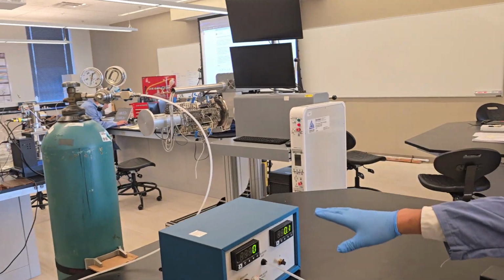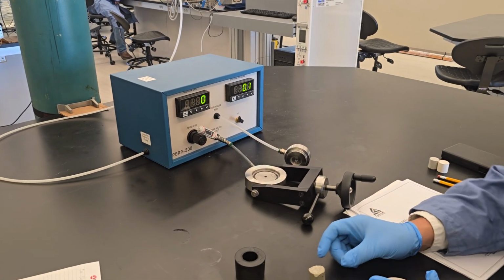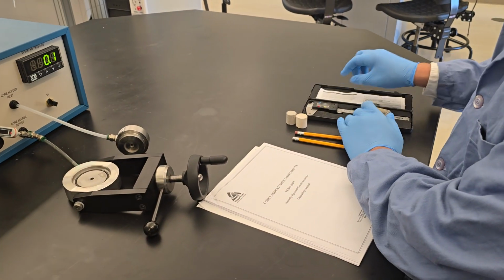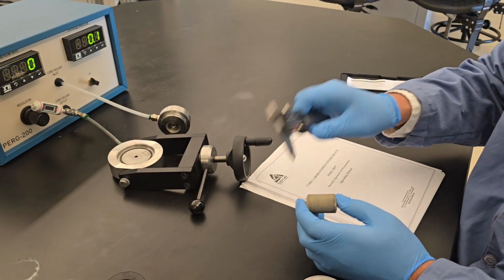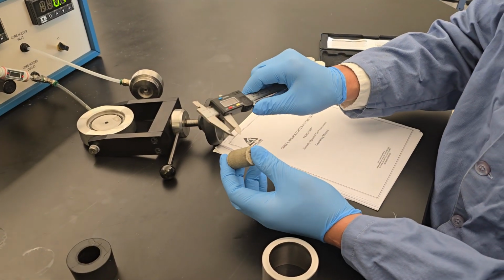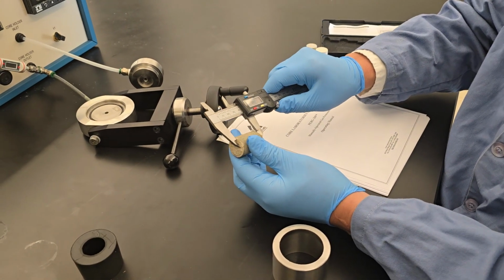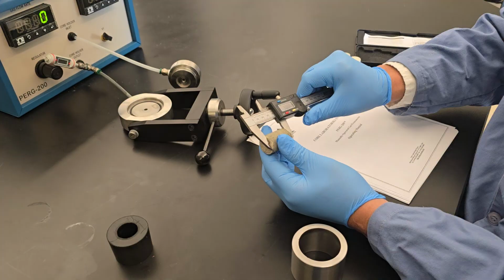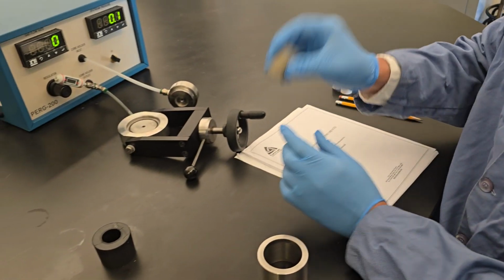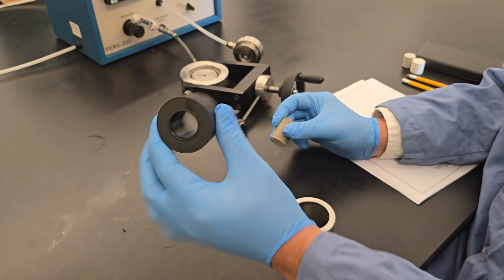We have the gas cylinder connected to our equipment, and the first thing we need to do is to set up our sample. So we get our sample and we measure its length and diameter, similar to the last experiment. Use a caliper, make sure it's 0, then you get the diameter, you record it, then you get the length, and you record it. Once you get these data, put your caliper back, then that sample goes into this rubber container or rubber holder.